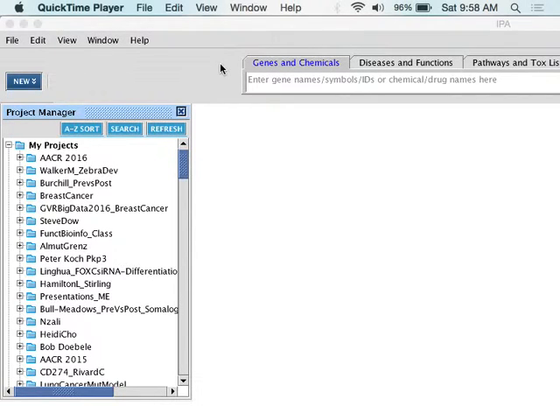First thing we have to do, all this stuff takes a while. What we're going to do is use IPA first. And I really like IPA. I would say IPA is probably the gold standard of all this bioinformatics software.